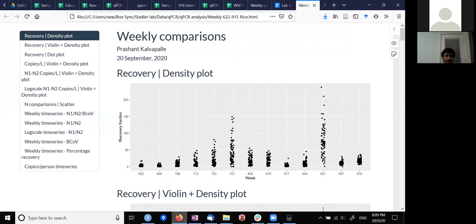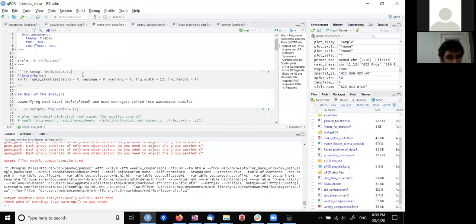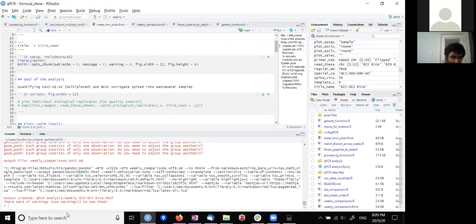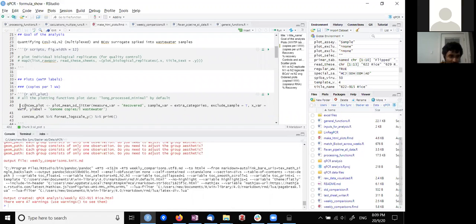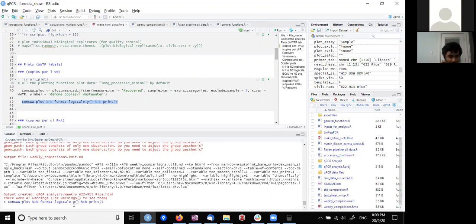No, I don't believe so. Okay, so I'll show you one. There's this package called Plotly, and that has a very nice function that takes any ggplot that you make. So, for example, let's see if this works.